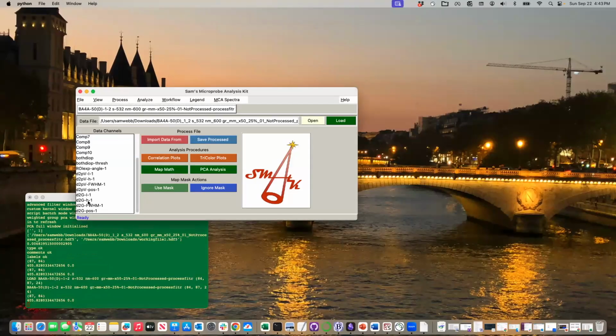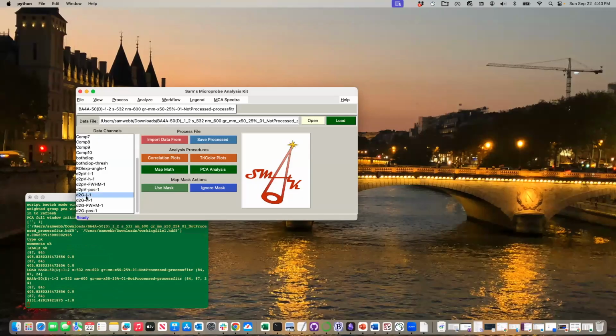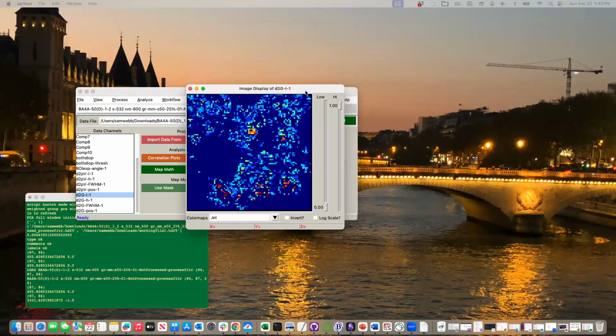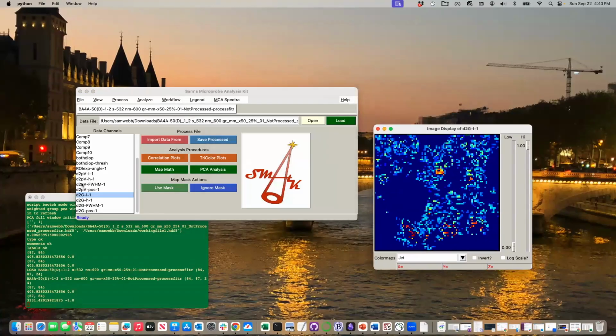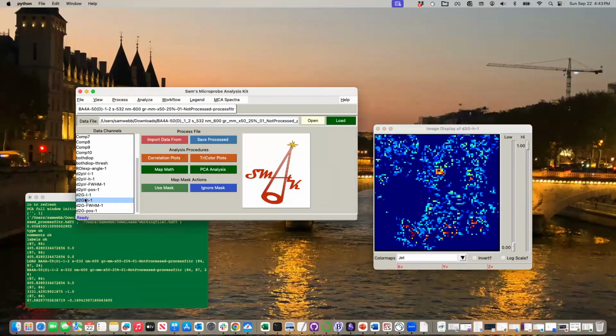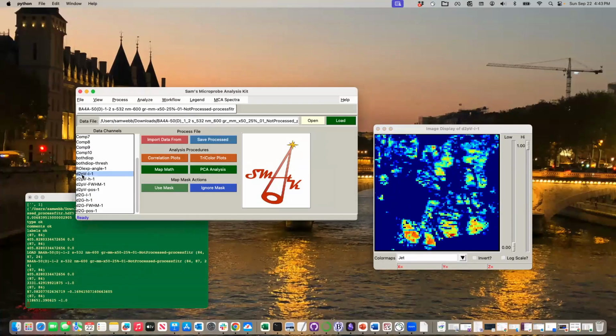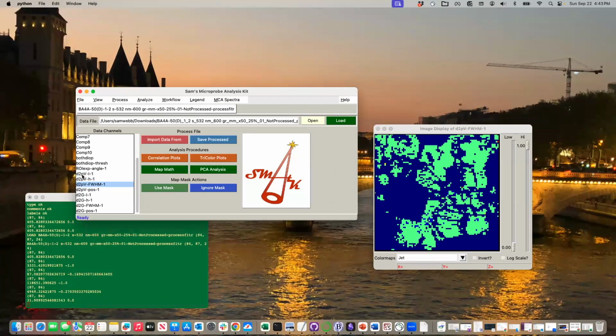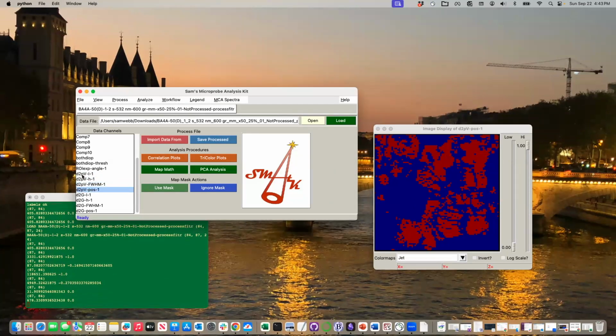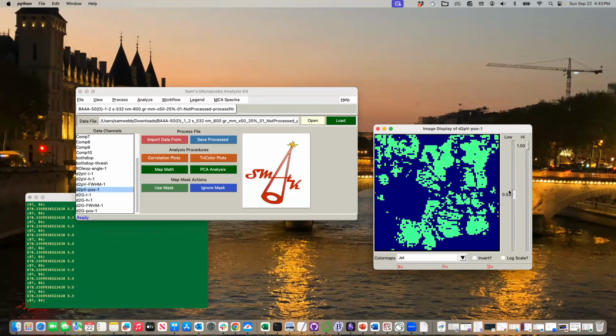And so we can see that it fits the intensity of the peaks there. Let's see. The peak height. Is this the better one? Yeah, there we go. The intensity, the peak height, the full width half max, so how wide that peak is, and it picks out the position here. While this looks all the same here, it is, well, because it's scaled a little bit weird.